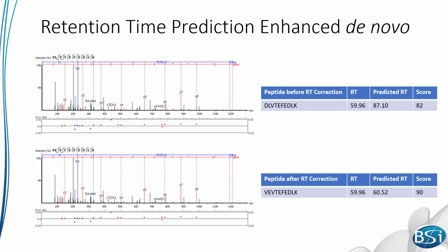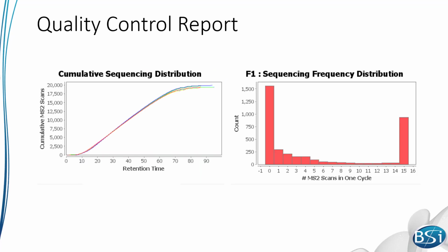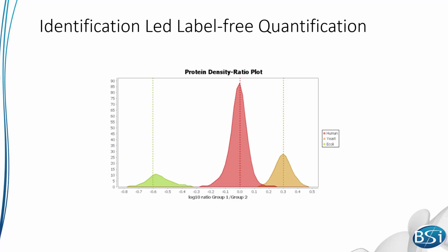A retention time prediction algorithm has been added to provide added confidence to de novo sequencing predictions, and a new quality control report has been added to provide further statistics about your results. And a further improvement to our label-free quantification has been added with identification-led quantification.